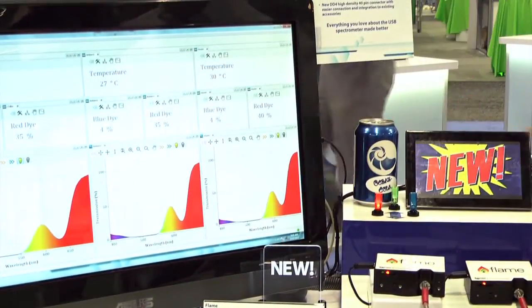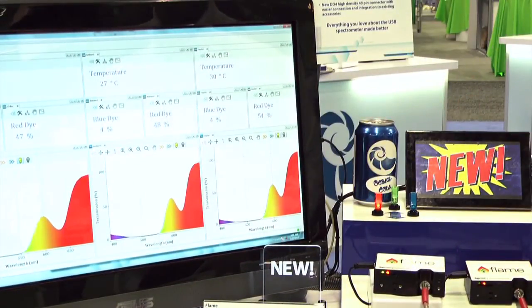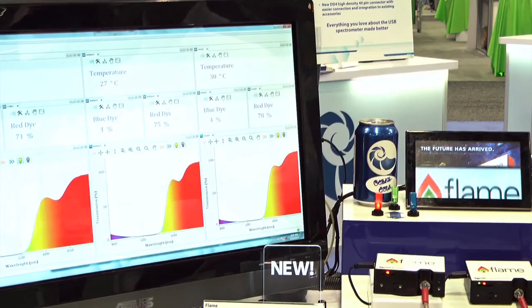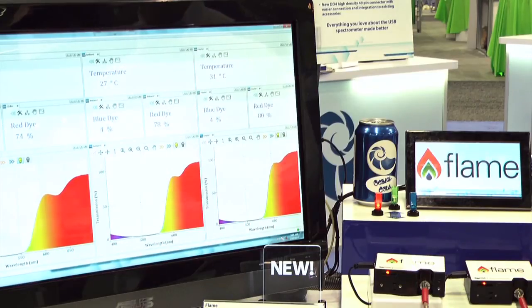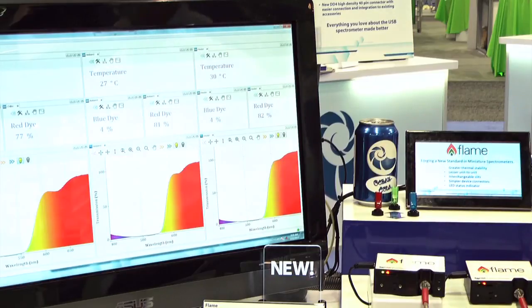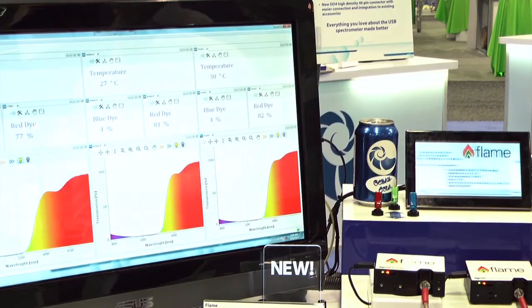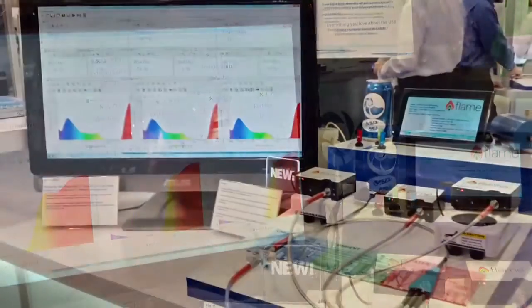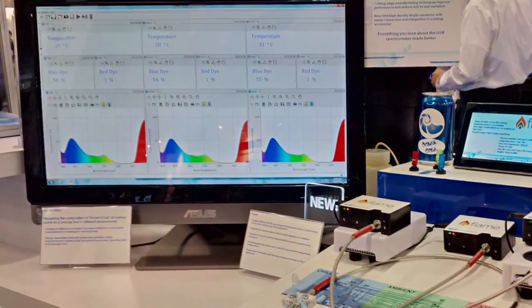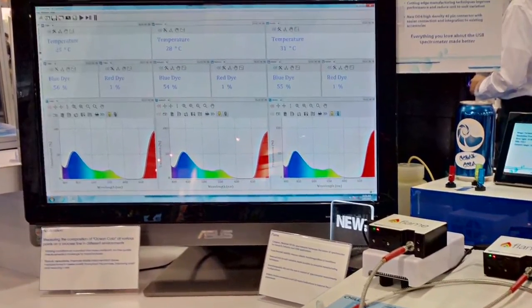Now as we change our process — here I am adding red dye into our facility — we can begin to see the change in the chemistry that we need to monitor. We see the concentration of the red dye beginning to increase. Now if we let that stabilize, as it would in any flowing system, we see that even at the different temperatures, we get the same concentrations of the blue and the red dye in real time.